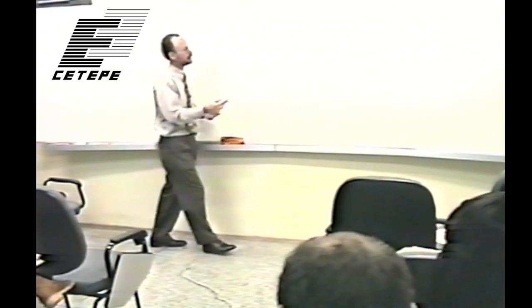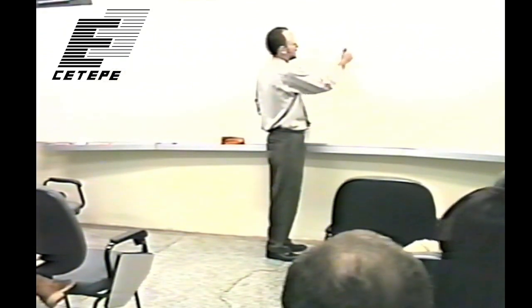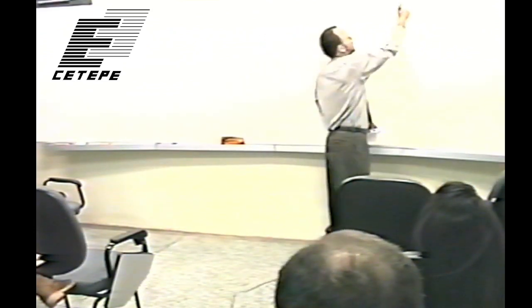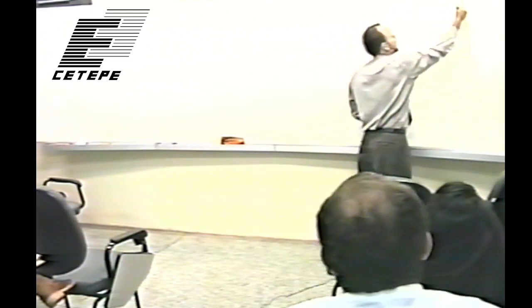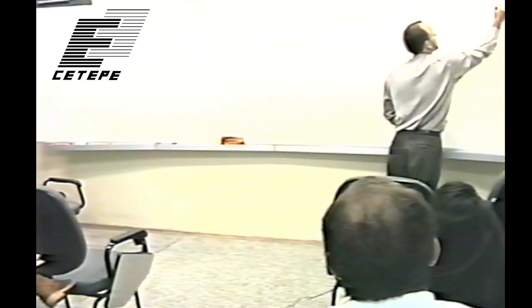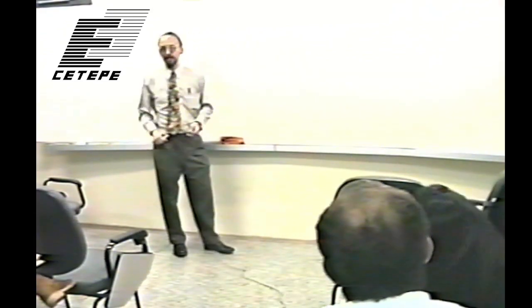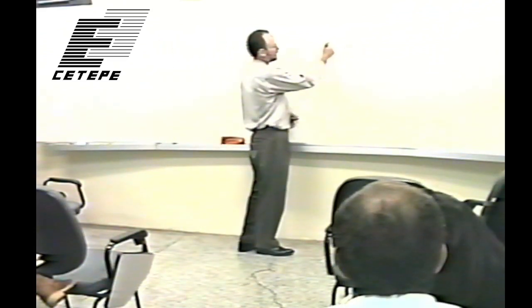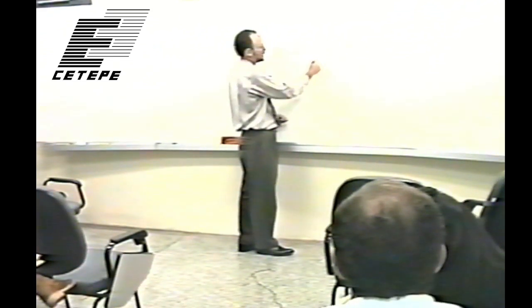So then you get many more X-rays being absorbed and giving off visible light, which then goes on. Visible light, blue to green, is 2 to 3 eV. These are very low energy, and they will almost all get absorbed in the emulsion. If an X-ray doesn't get stopped in the front screen, it might get stopped in the film, very, very rarely. But then the higher energy X-rays might get stopped in the back screen and go off to expose this emulsion.